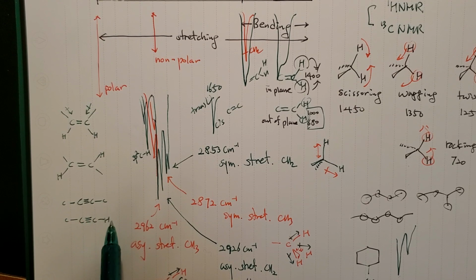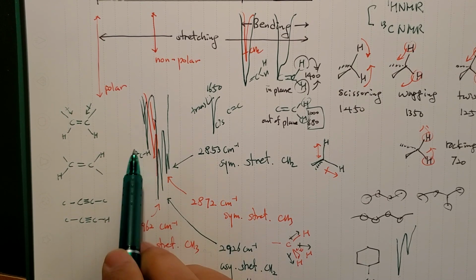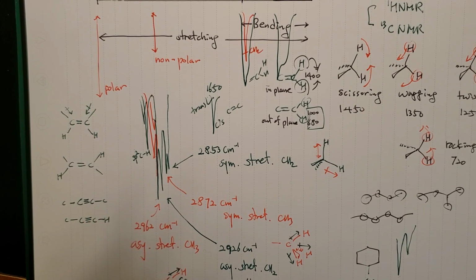But intensity wise, this can be quite bigger than those of the sp2. Then, since you have one hydrogen, the bending vibration of the alkyne, there are not so many difficulties to bend, right? But there is no scissoring. It's all the same whether you go in the plane this way or you go up and down. It's anyway the same bending vibration with a very small K value.